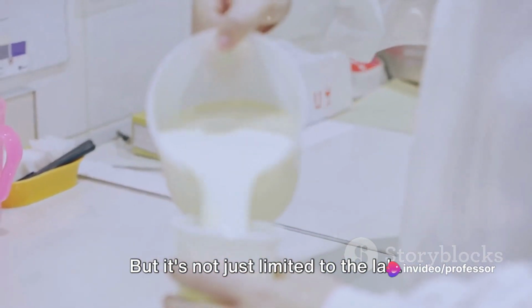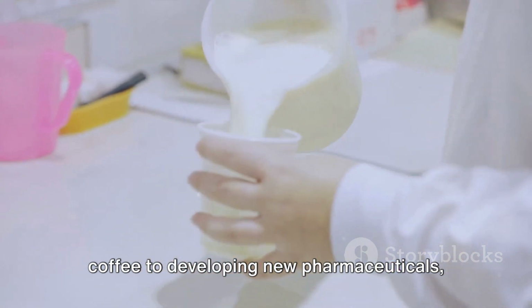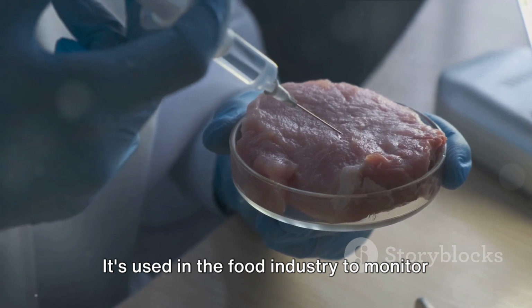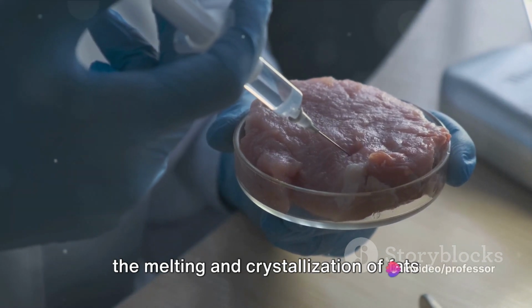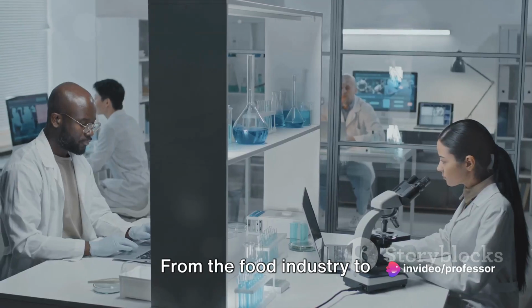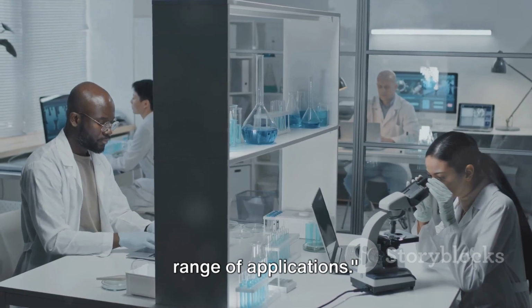But it's not just limited to the lab. From ensuring the quality of your morning coffee to developing new pharmaceuticals, DSC is everywhere. It's used in the food industry to monitor the melting and crystallization of fats, and in pharmaceuticals to study drug stability. From the food industry to pharmaceuticals, DSC truly has a wide range of applications.